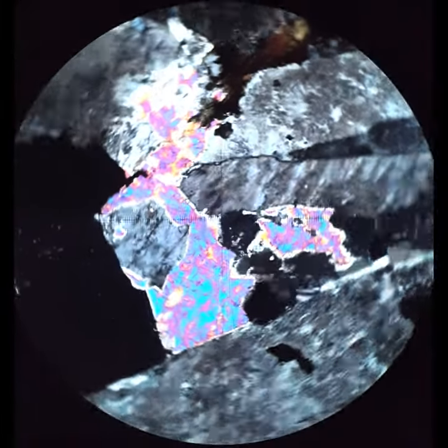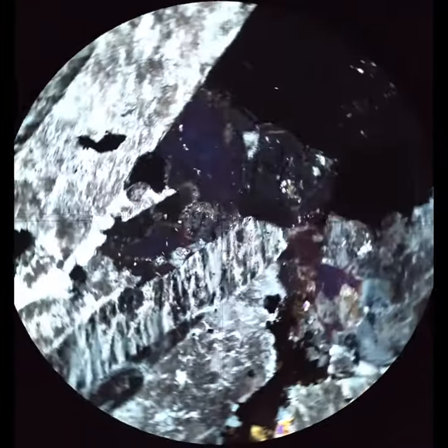This is definitely a case of guilt by association. If you have a rock that has k-feldspar and sodalite in it, so you know it's super, super alkali rich, then you can suspect that there might be minerals like cancronite in there.